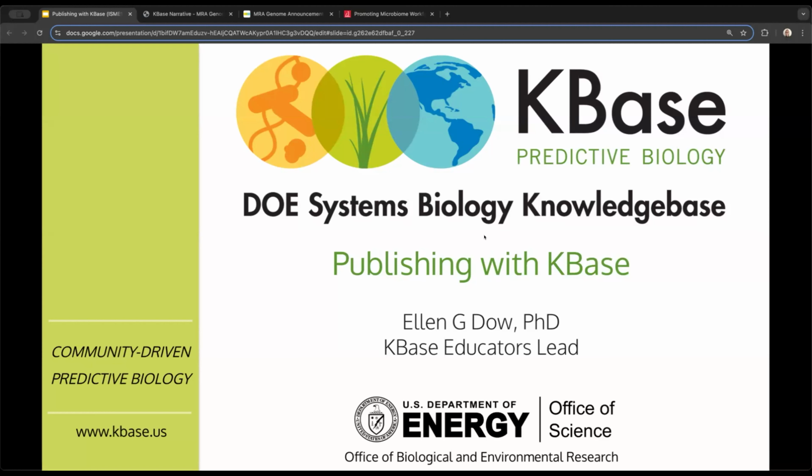Today, I want to talk about how you can really utilize KBase and make some really great narratives, some shareable workflows to improve your publishing or really help make your work viewable and usable by others.